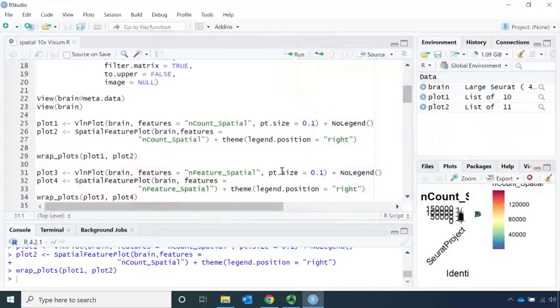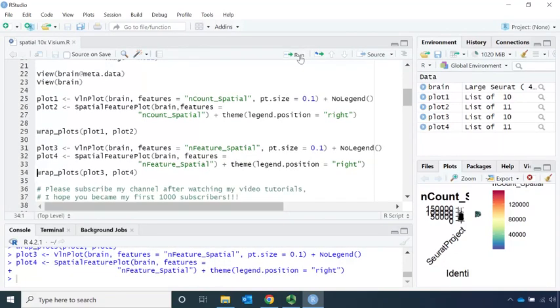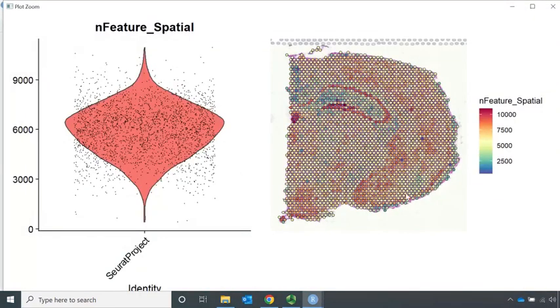We can also use the violin plot and the SpatialFeaturePlot to look at n_features. We name the violin plot as plot three and the SpatialFeaturePlot as plot four. On the right is the tissue image with all the spots, and on the left is the violin plot — you can see each spot has a high number of n_features.